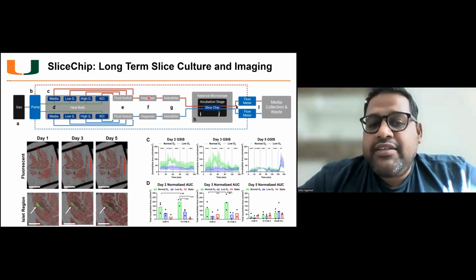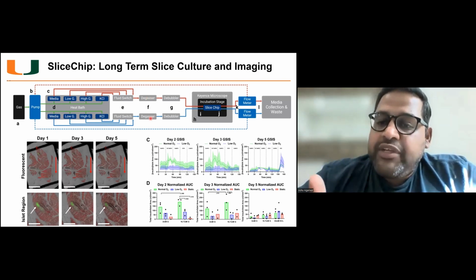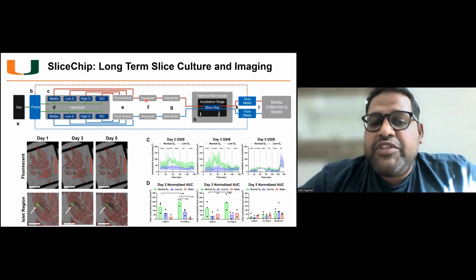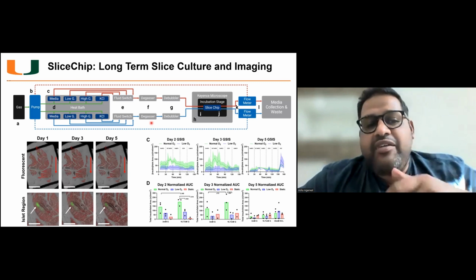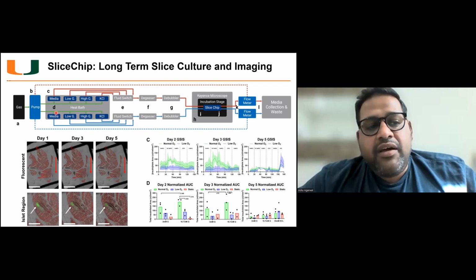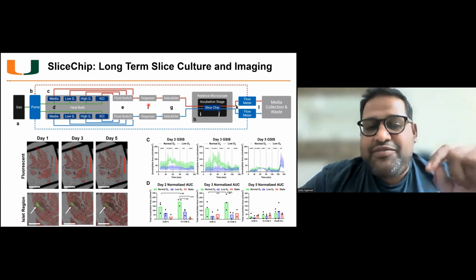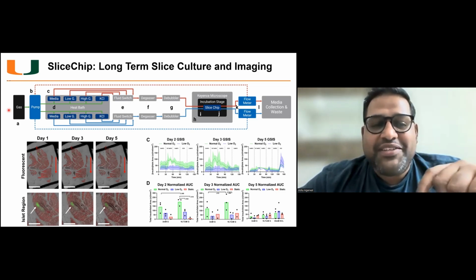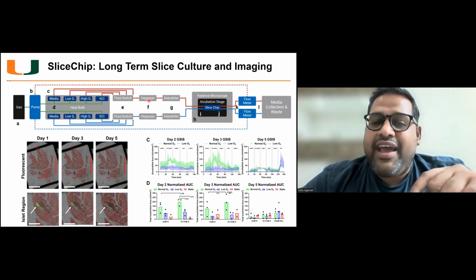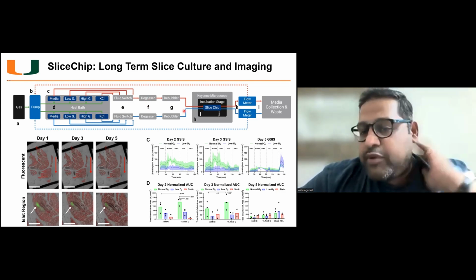So using degassers is the only robust way of really making sure there's no incubation, there's no propagation of air bubbles within the device. But once you degas it, you're also getting rid of the oxygen. So we used an oxygen tank to drive a pressure-driven pump, which would then get, just to confuse you guys, there was pure oxygen in the media, which was then getting degassed to get rid of other gases except oxygen, and then also a debubbler for good measure.